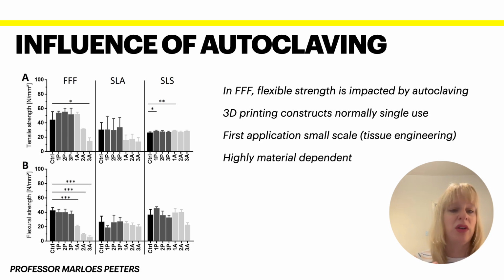So it won't just depend on the technique, but it will also definitely depend on the material that you're working with. So kind of issues that you might consider here, because even if you have it for single use, you probably want to sterilize your material before you actually start the reaction. What you would be concerned about is that there might be some leaching of the material going into the bioreactor itself. So the fact that you're maybe not able to clean it as well as you can with, for instance, stainless steel, which is a big advantage of stainless steel, this might actually hamper this particular application.